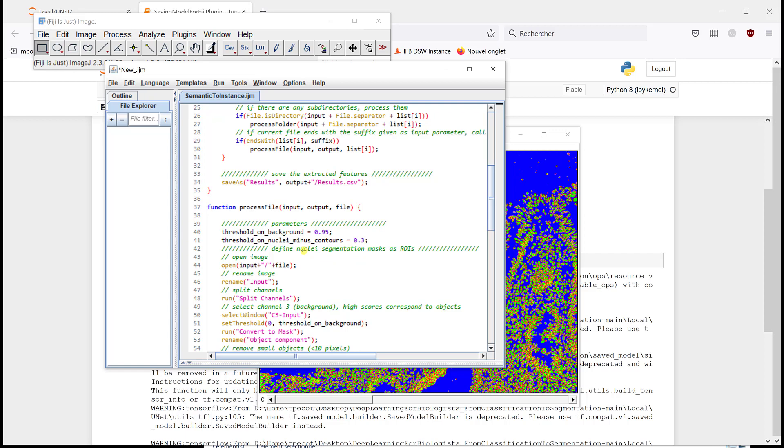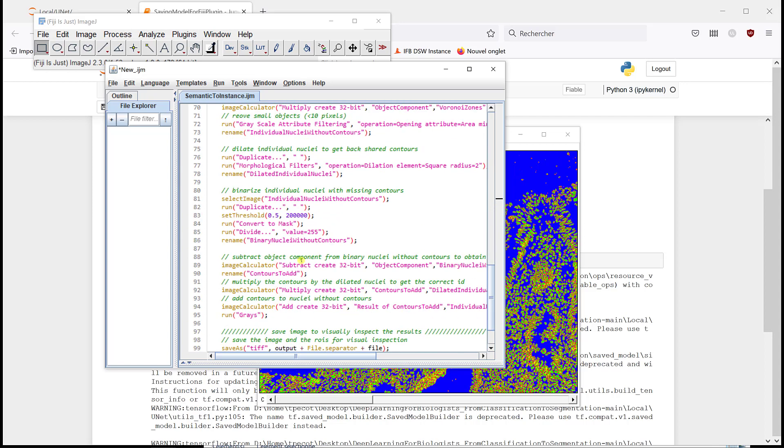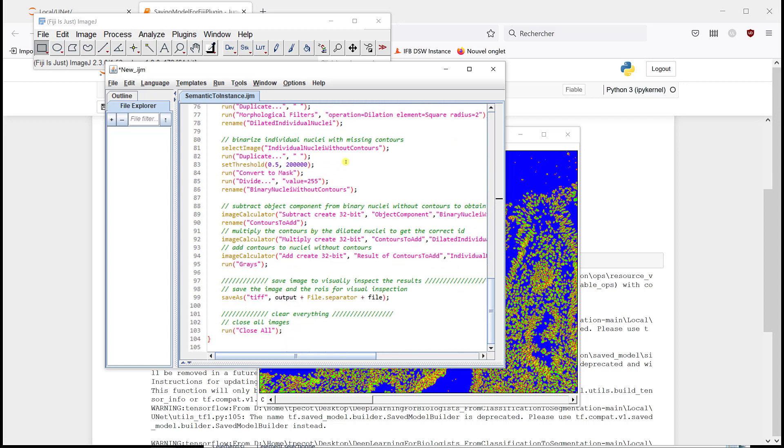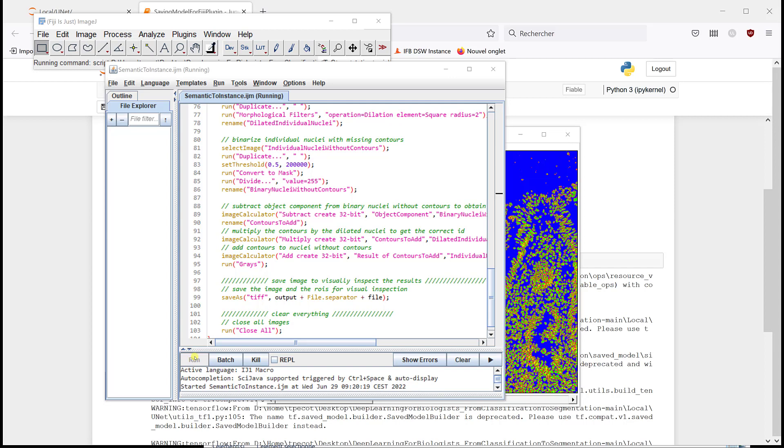So here is the macro. So again, if you want to have a better idea of what it does, you can go to the course. You have two parameters, one threshold on the background. So it means that every pixel that has a score of 0.95 for the background can be part of the background. And then you have a threshold on nuclei minus contours, because we do the contour component that we subtract to the nuclei component. And there are commentaries, so you can try to understand how it works. I'm going to run it.